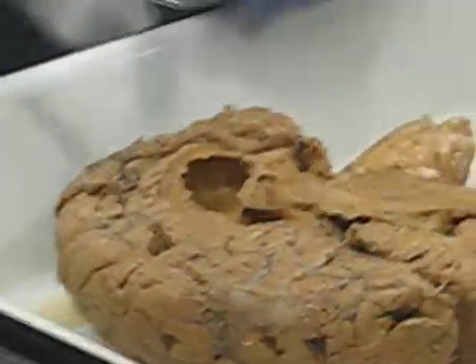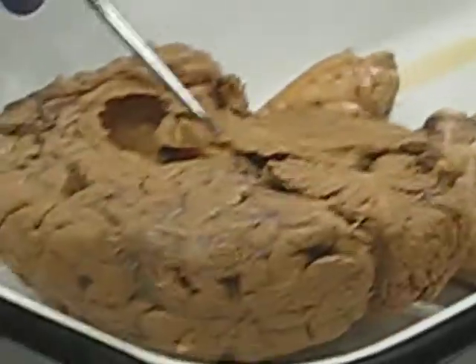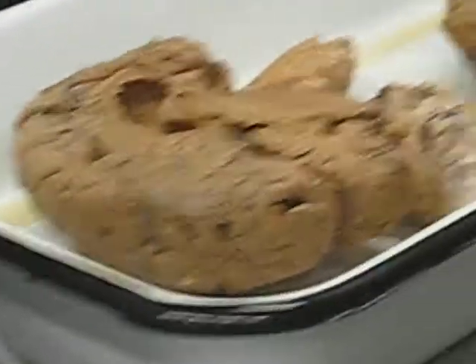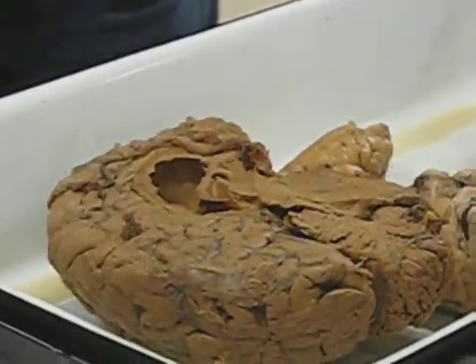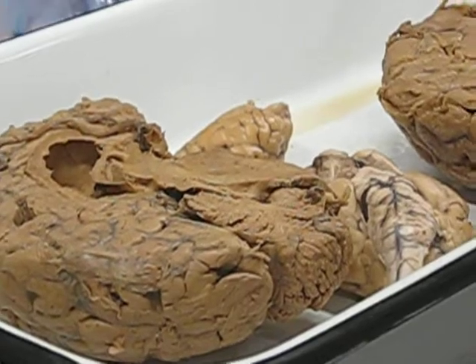The thalamus, it's the wall of the third ventricle. There's the third ventricle there. The intermediate mass, this one has an intermediate mass. There's no intermediate mass on the thalamus here, but right there, see that little projection? That's the intermediate mass. Is it normally round on a whole brain? It's where the thalamus comes through from both sides and touches in the middle. And so when we cut through it, we wind up with a little nub. Not all brains have it. This one doesn't have it.